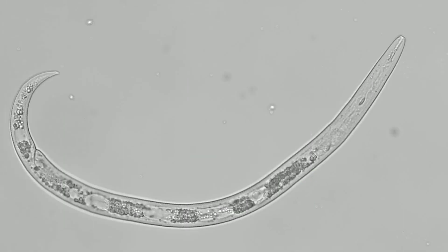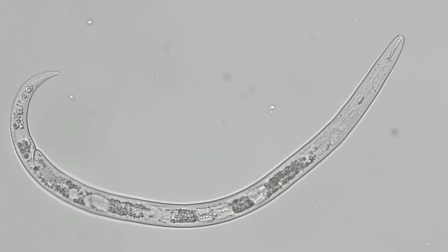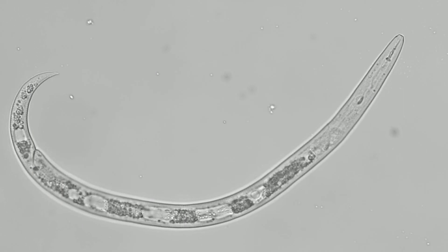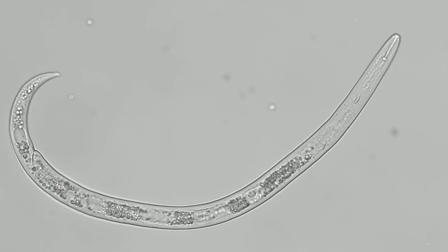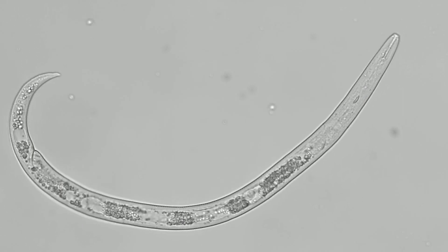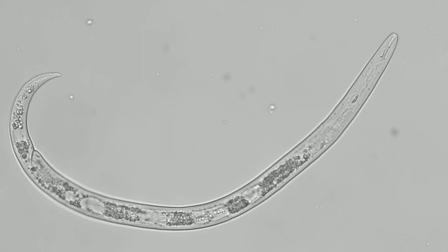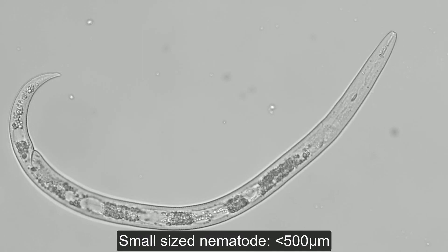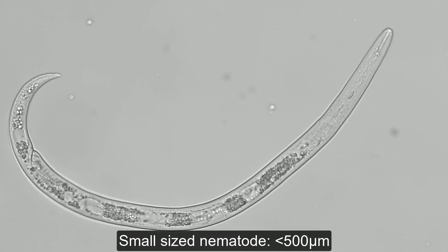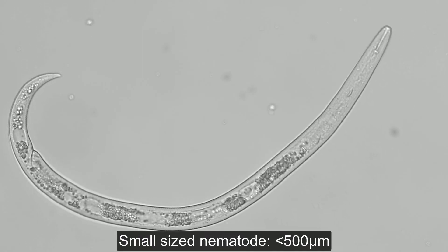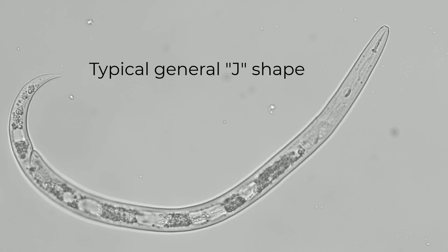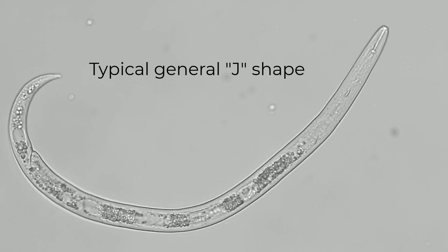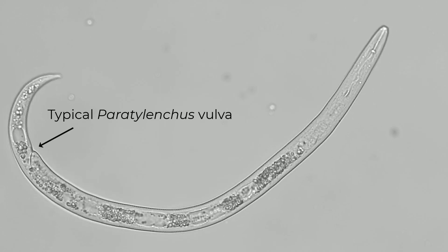In this second part of the video, we will observe these characters in detail with the aid of a microscope. At this level of magnification, we can observe the size of the nematode, which in this case is generally small. We can also see the typical general shape and also the position of the vulva.